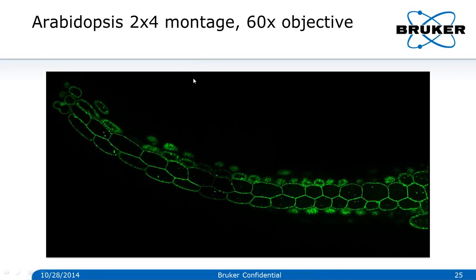It also benefited from the fact that this area that you see here as background, we were able to turn off acquisition using the pruning function that I showed in the previous slide.